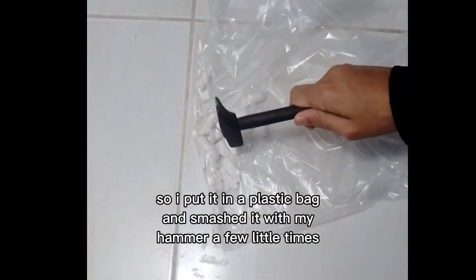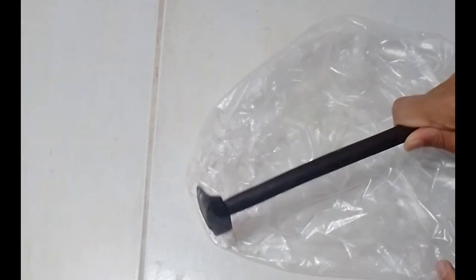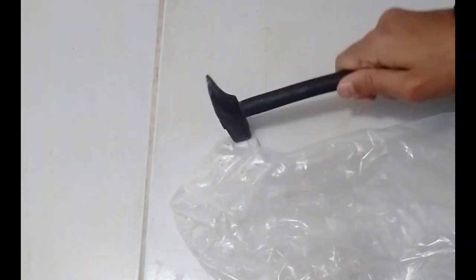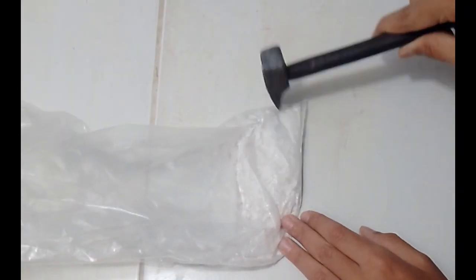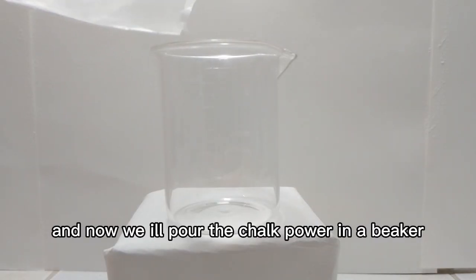I put it in a plastic bag and smashed it with my hammer a few times. And now we'll pour the chalk powder into a beaker.